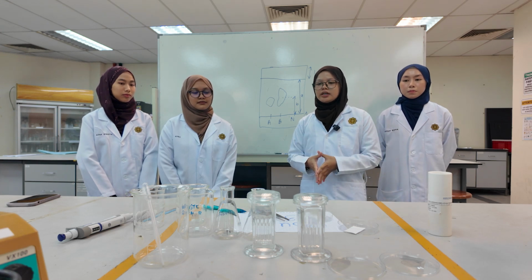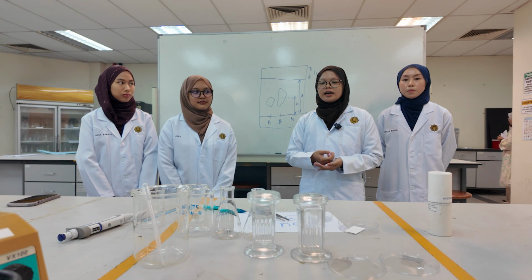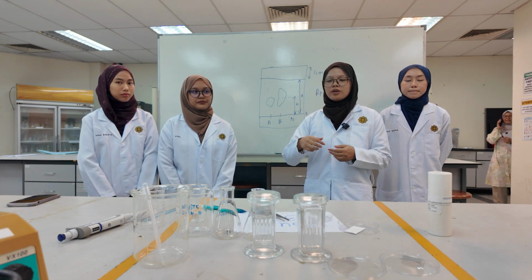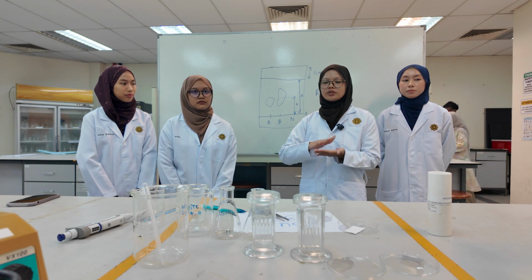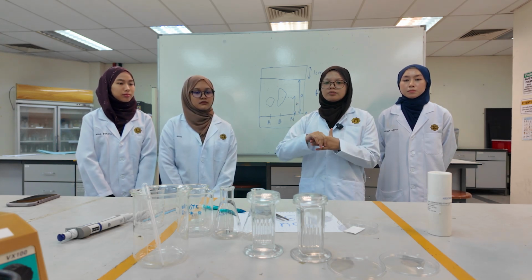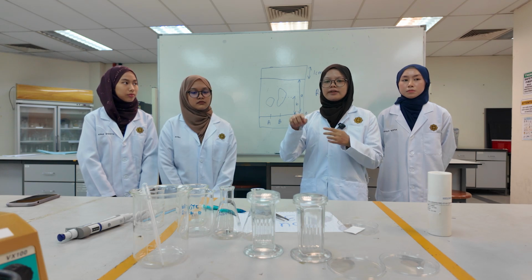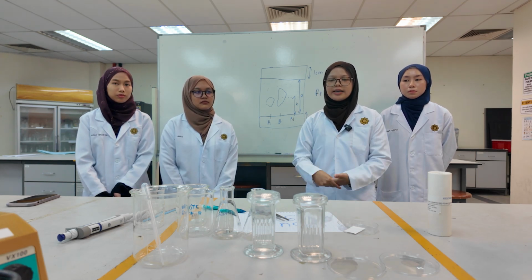The next one is we need to deal with UV light for this experiment. And as we all know, UV light is very dangerous. So we need to make sure that we view the UV light behind a transparent screen, so that we don't have any direct contact with the UV light because it can irritate our skin and also eyes.